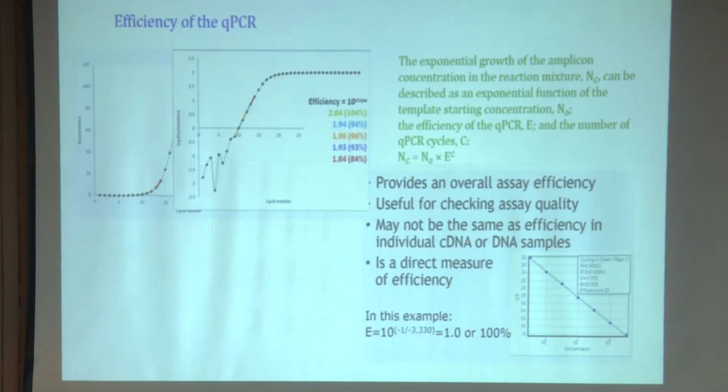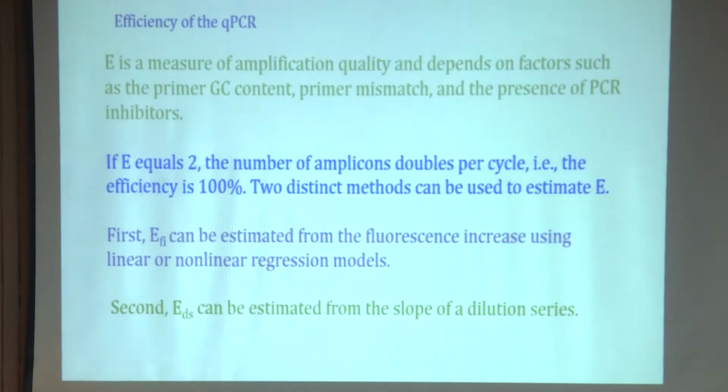These two are very important when you want to calculate the number of gene copies. Copy number and gene copies have some kind of a contradiction. When you talk about copy number, geneticists are not happy with us because they say you are talking about something else. But as microbiologists and pathologists, we know what we talk about, we talk about the gene copies.